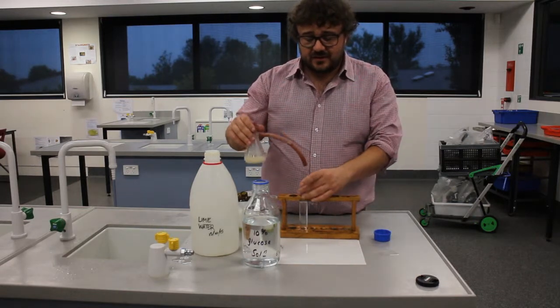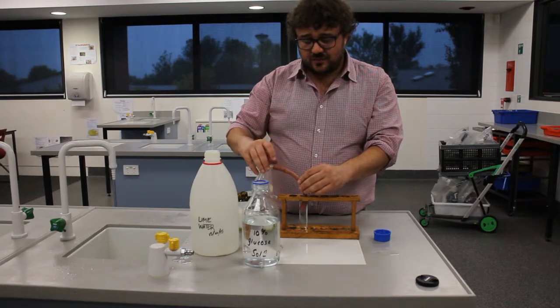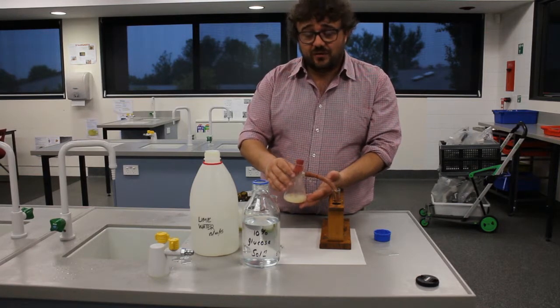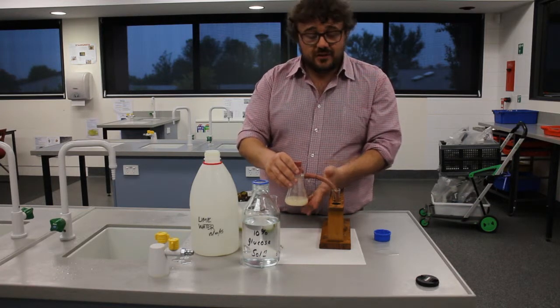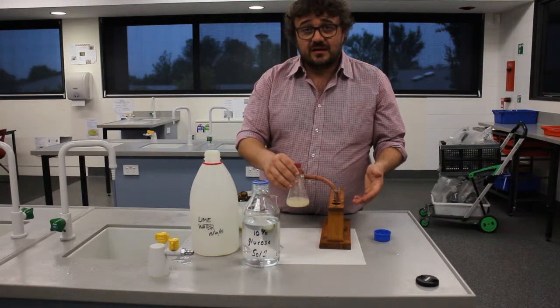You now set it up so that this rubber tube is submerged into the lime water. It won't just hang in nothing — this will go into a hot water bath, or a warm water bath, at about 30 degrees to make it a nice temperature for the yeast to grow. That's our experiment. I'll insert a photo of what it's going to look like in the hot water bath.